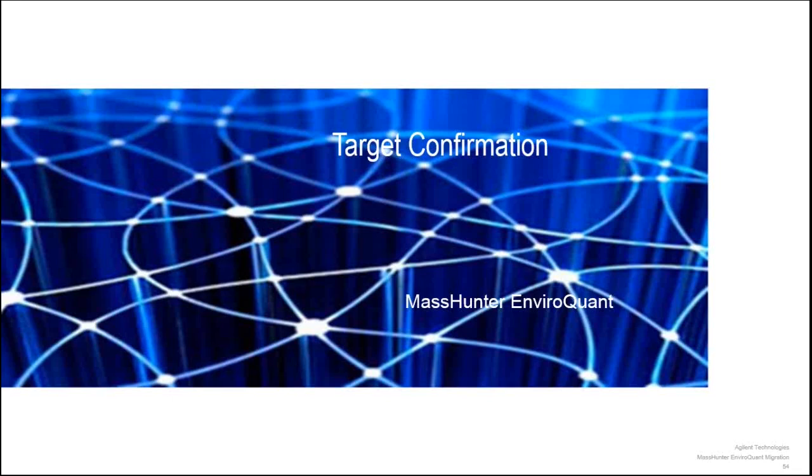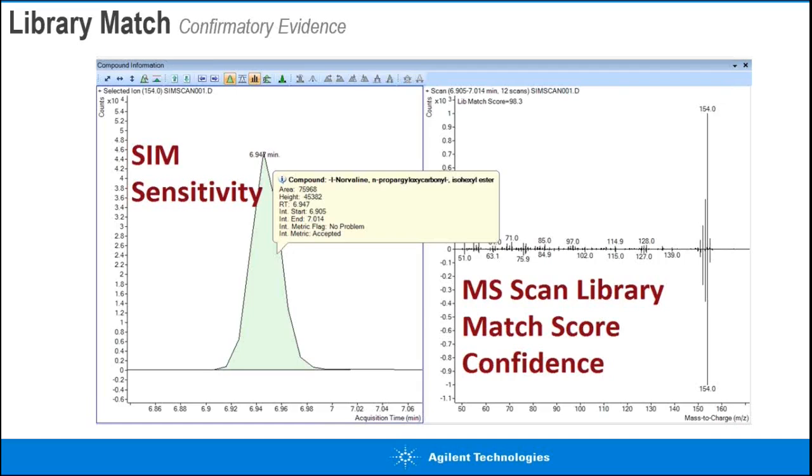And I'd like to discuss what I'll call confidence. I can use the word confirmation. Some people believe that can only happen in church, but confirmation of a result, a measure of confidence, is important. If you're going to report results, it comes down to false negatives and false positives, and you certainly don't want to err any more than you need to. So a positive may have somebody taking an action on it. You want to make sure that you've got solid results there. So how do you get there?